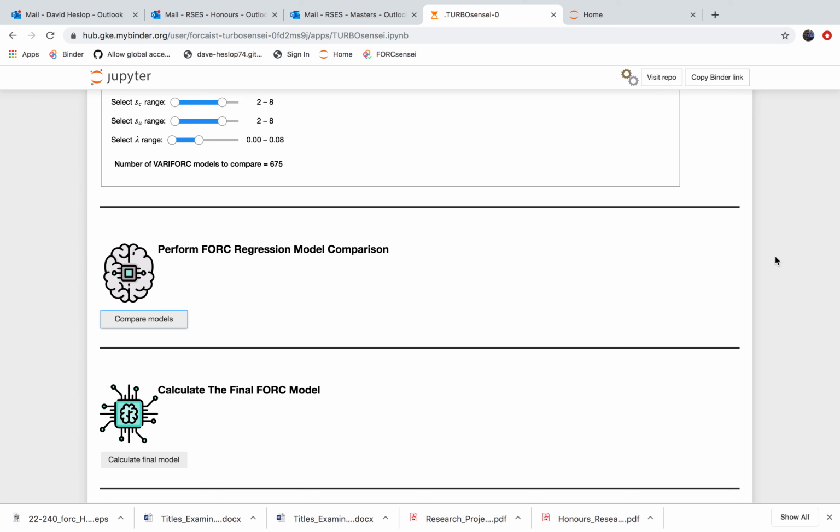So in that way, it's a really convenient way of being able to update things. All I have to do is update the code on GitHub, and the next time I launch an instance on the cloud, it will automatically use that. So it's very easy to maintain. You barely need to interact with the cloud at all.